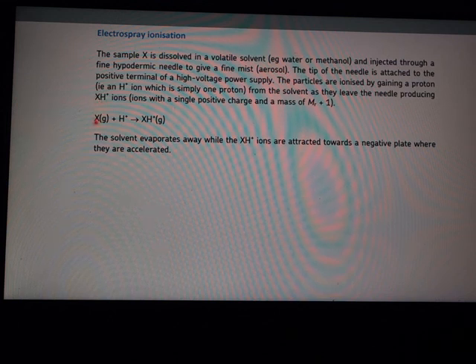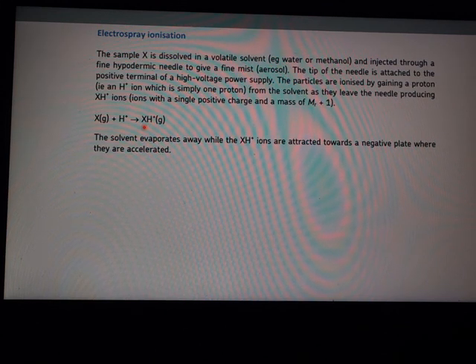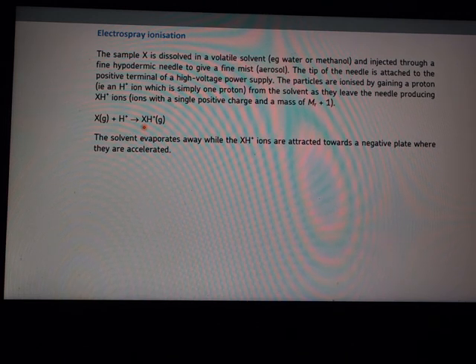So at the end, you've got your ion created like this. We've got a gaseous sample, and it gains a proton, so it turns into a positive ion, and that can be accelerated. Okay, so what is detected here is the mass to charge ratio, but +1. It's the mass +1 to charge ratio. So that's what we need to take into account. We'll need to take away 1 from the measurement. Okay, so it's also one of the questions that's often asked by the examiners.